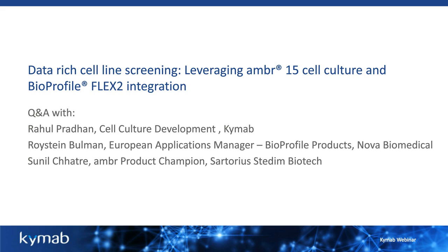So this is a question for Nova Biomedical. We do have a set length from the analyzer to the ambr system. So if you're working with an integrated analyzer, we're looking at a maximum of roughly about 30 centimeters between the ambr system and the analyzer itself.